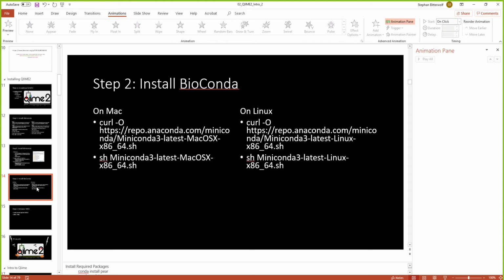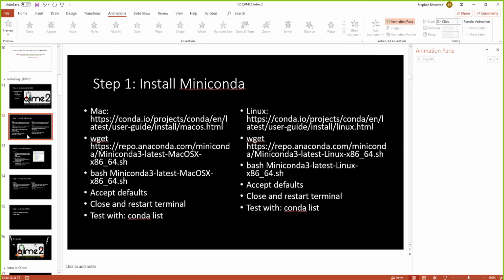Hey, Stefan. Yeah, Terrell? Should I run the cleanup? Is that needed? Sorry, underneath install QIIME2 with the Conda environment on the docs, there's an optional cleanup script. Sure, you can run it. I don't see there's anything wrong with the cleanup. I think what it's going to do is delete the install file. Okay, well, sounds good. I'll do it.